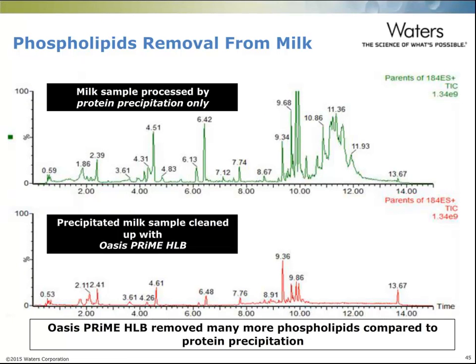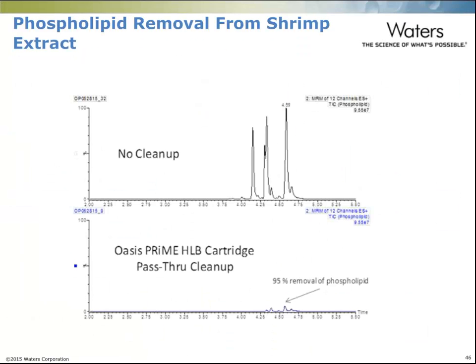Looking at phospholipid removal from milk samples: the top chromatogram shows the milk sample after protein precipitation only, with a very high amount of phospholipids remaining. After passing through the Oasis Prime, the bottom chromatogram shows most phospholipids have been removed. For shrimp extract, similarly, there are three major phospholipid peaks, and after cleanup by Prime HLB, almost 95% have been removed.